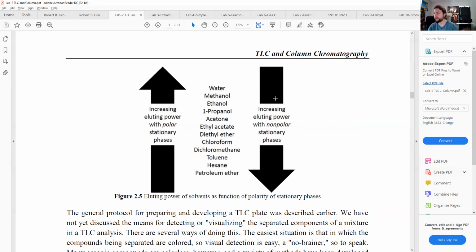So in the instance of reverse phase chromatography, you could use water, methanol, ethanol, and then of course you can't go too low on the reverse phase because you encounter the same situation. Maybe I don't know if it would strip the machine of its coating, but it is commonly used to utilize hexane to remove grease from glassware.